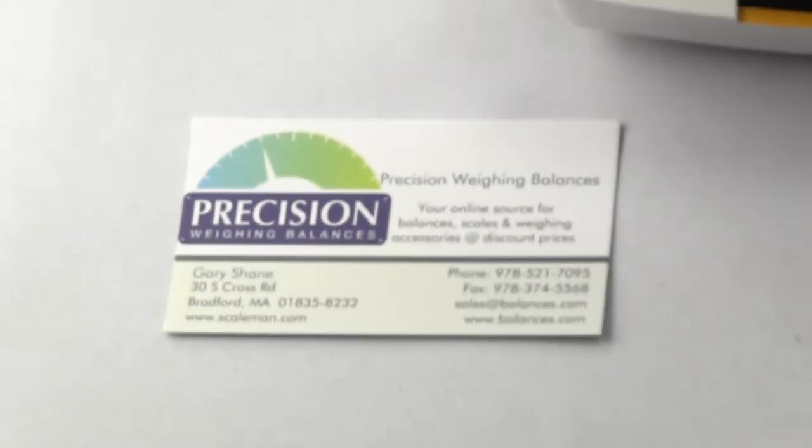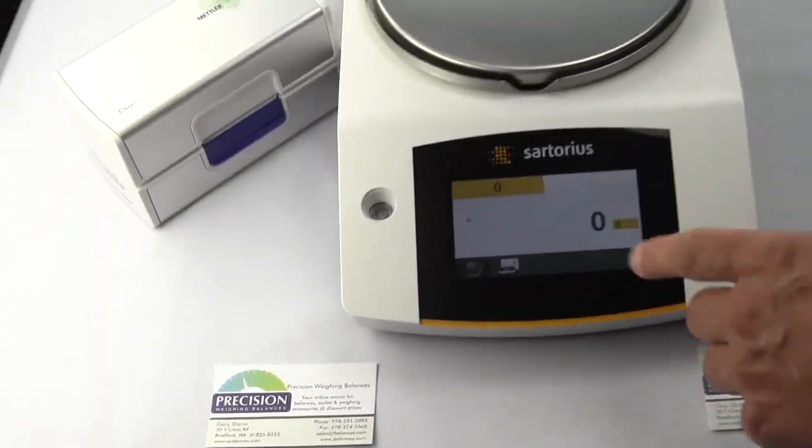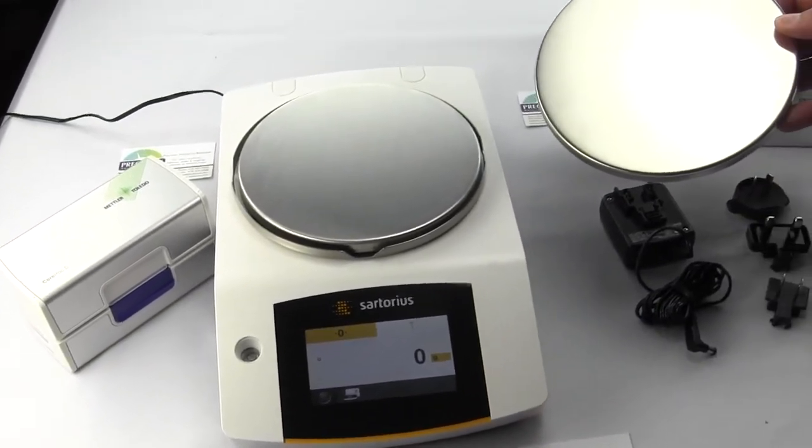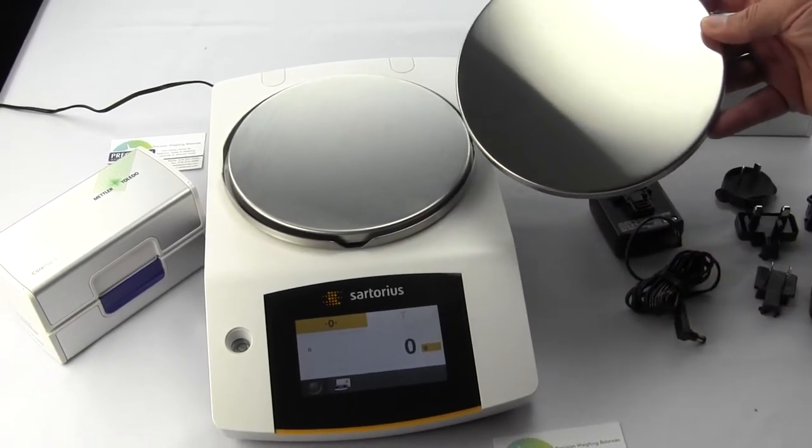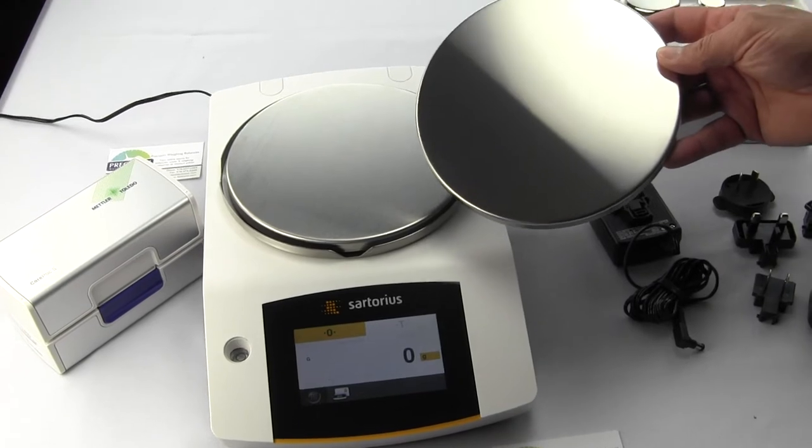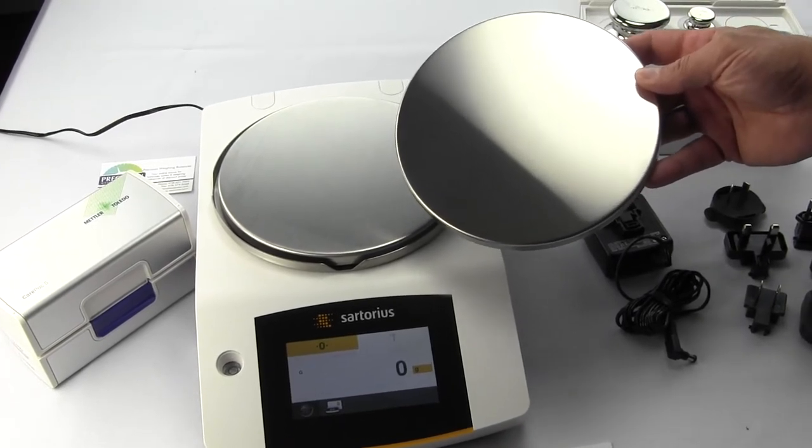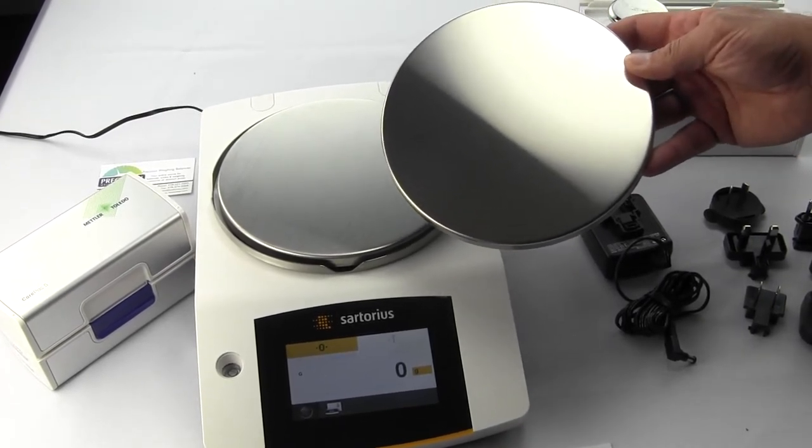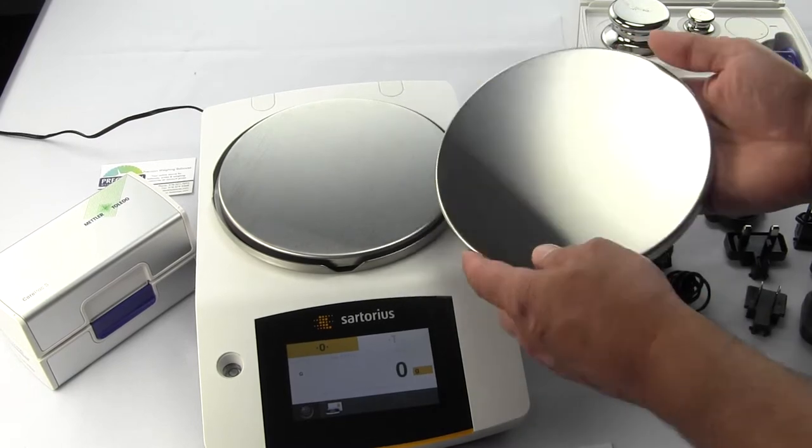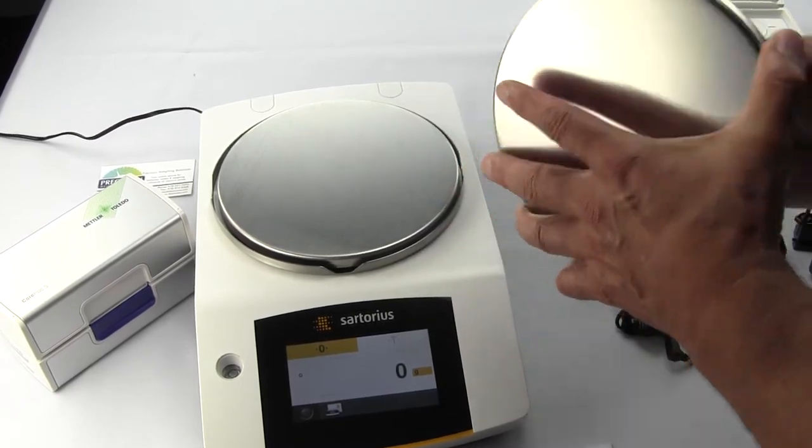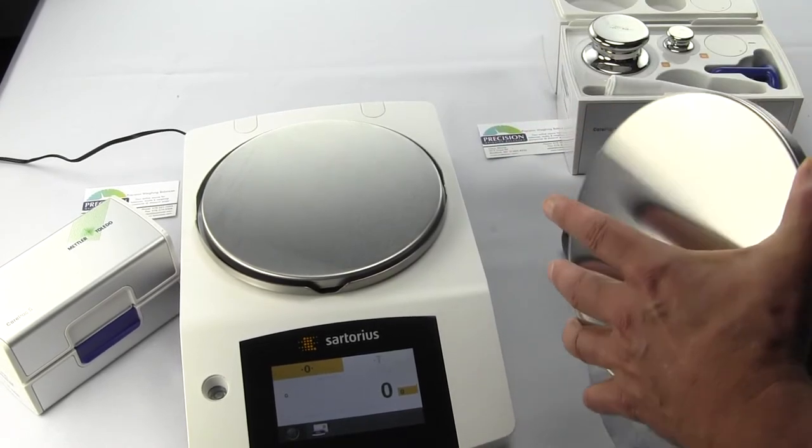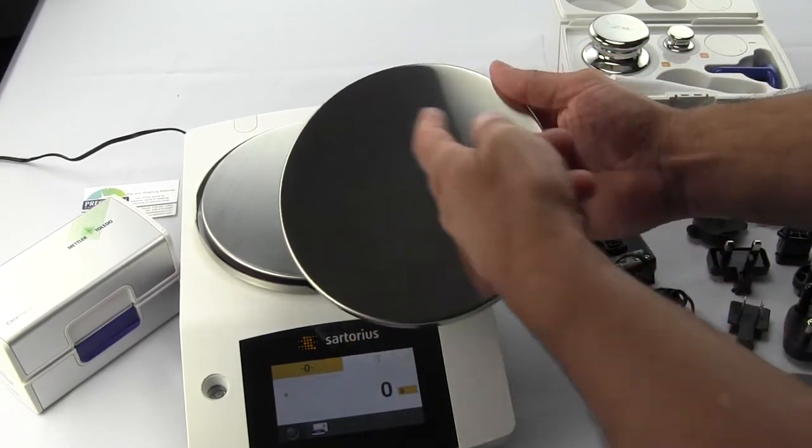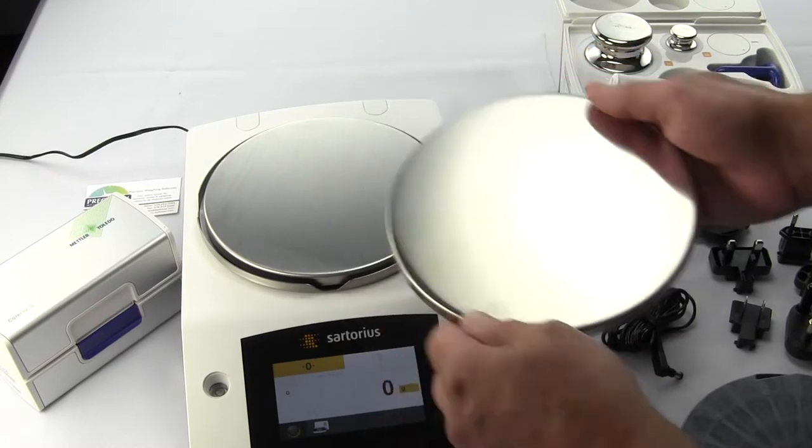In regards to the Practum precision scales, this model is to 1 gram. These models have a nice large round pan—this is a 7 inch or 180 millimeter diameter pan. It's a nice stainless steel pan with a pan support underneath, so you can easily clean your platform.